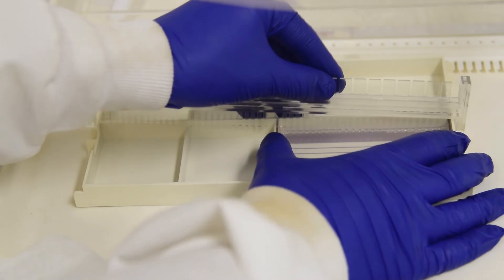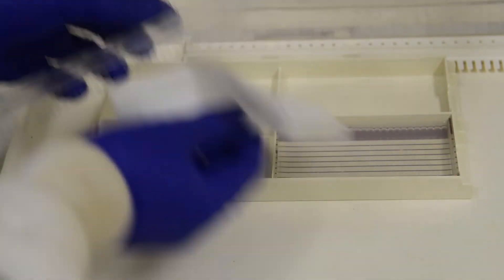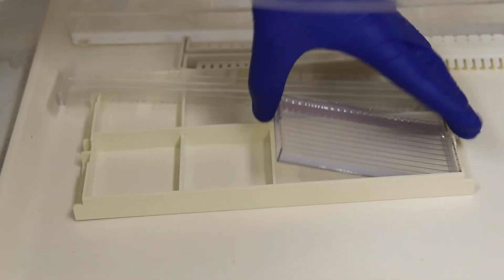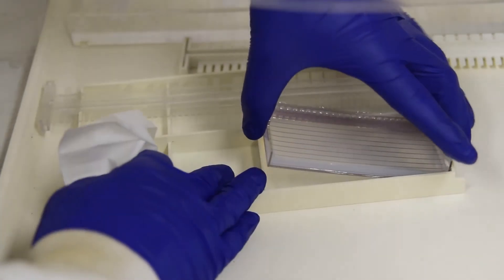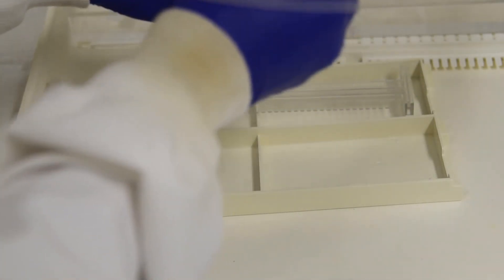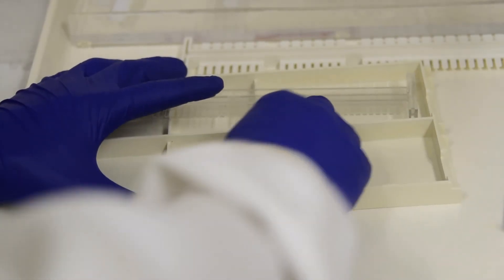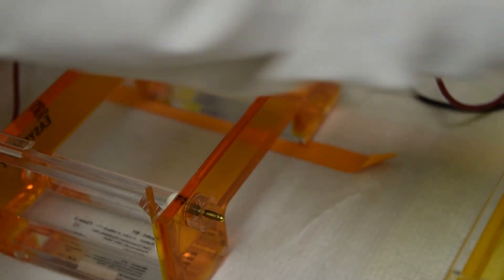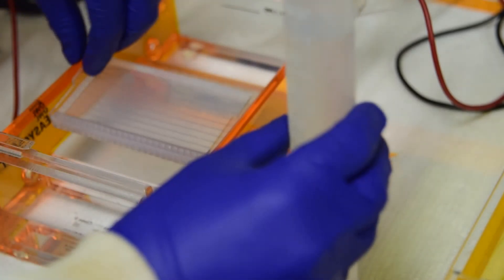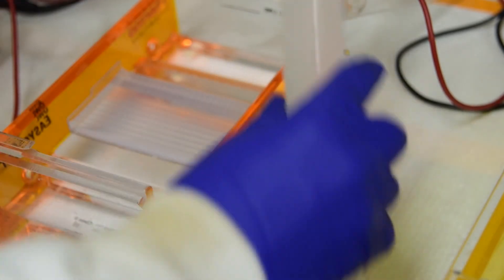Remove the gel from the mold and clean the comb, mold, and outside of the tray. Place the gel in the gel tank in the right orientation, walls away from you, and add 0.5x TAE to cover the gel.